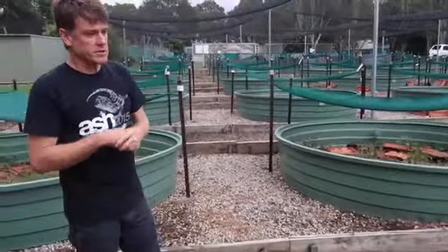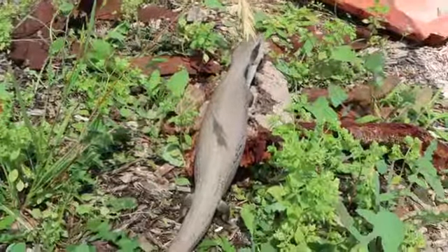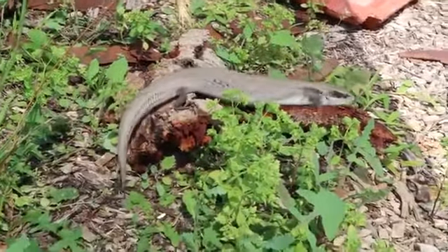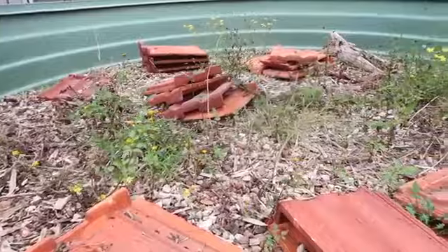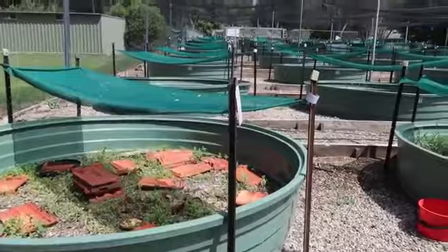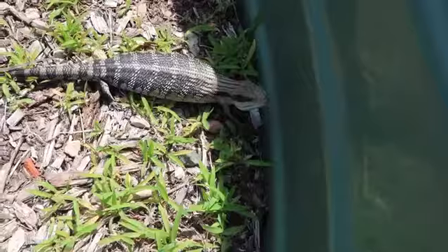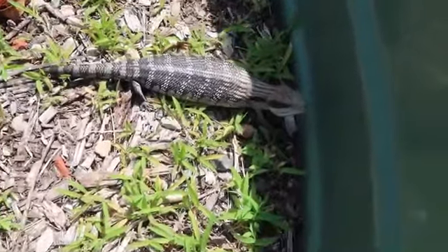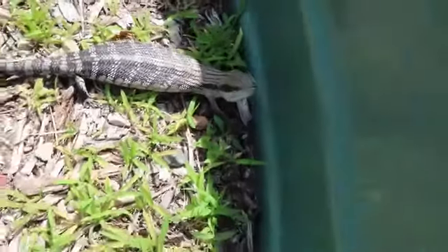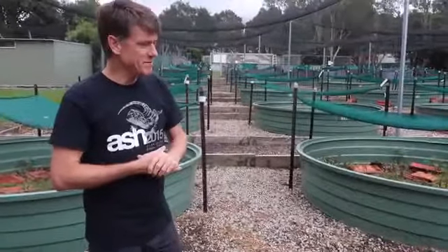So typically we would keep lizards in here that we're doing behavioral experiments with, and we can use these tubs for different experimental manipulations. And it's just a really good setup for keeping lizards outdoors, where they do much better, and they tend to be a lot more healthy living outdoors under semi-natural conditions as opposed to indoors. And it keeps the budget down for lights and whatnot. Yeah, absolutely. It keeps the budget down.